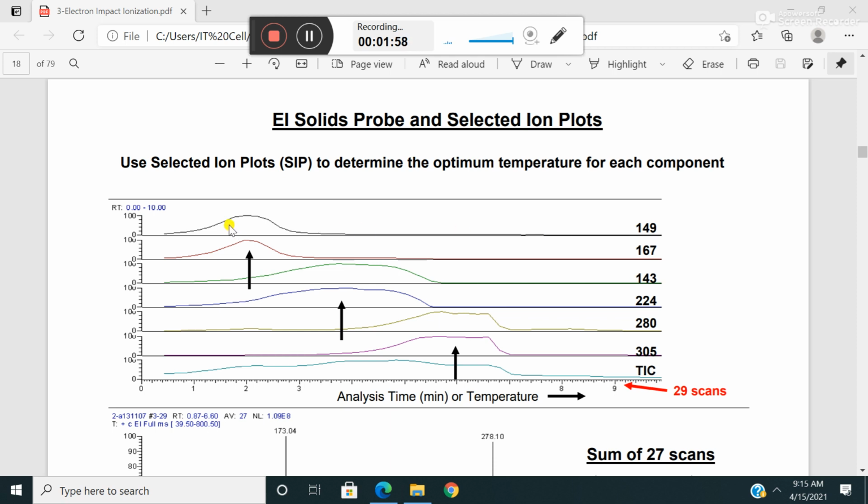So if we assume that this mixture consists of these many components, and we have plotted the graph of these components, you can see this is one component, another, third, fourth, fifth, sixth, and these are the intensities of those peaks, right? Some of the components come at the highest intensity, some at low intensity.